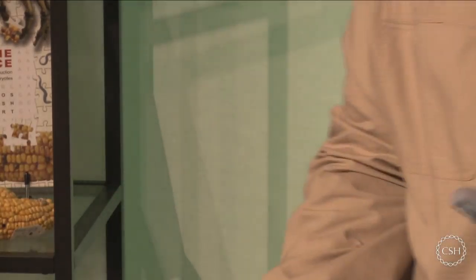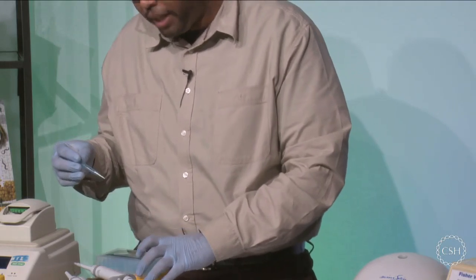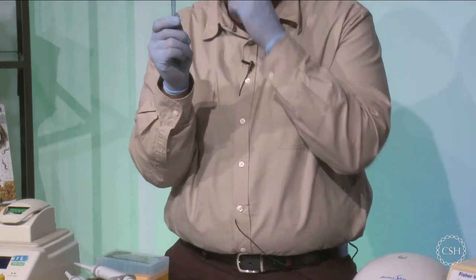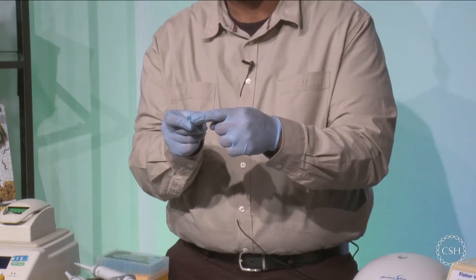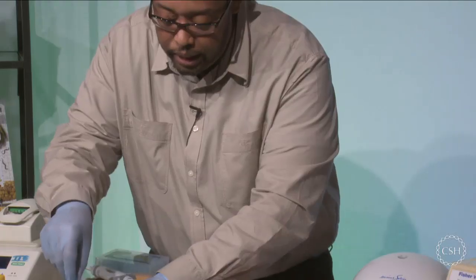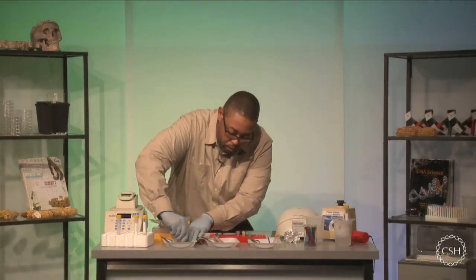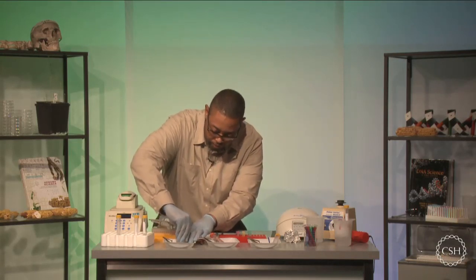Okay? But I'm just going to collect some tissue from this plant here. Typically from a plant, what I like to do is collect a hole punch, and I don't want to go making a whole bunch of different types of hole punches available to me. So I'm going to take a sterile tip out of my tip box, and I'm going to use just this large opening here in the front to punch a hole into my physical tissue here. I'm going to move over to my tissue, press down into that tissue really hard and make a twist or a circular motion. The idea is to create just a punch of that tissue.